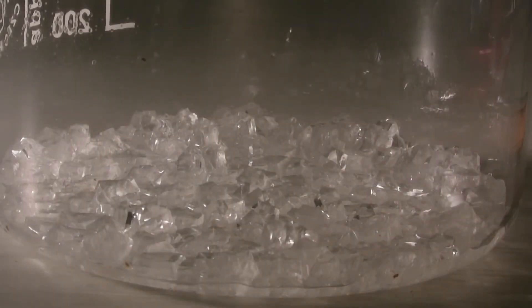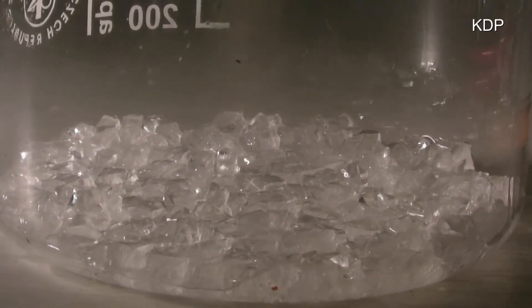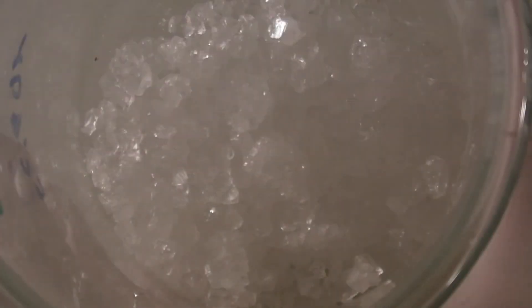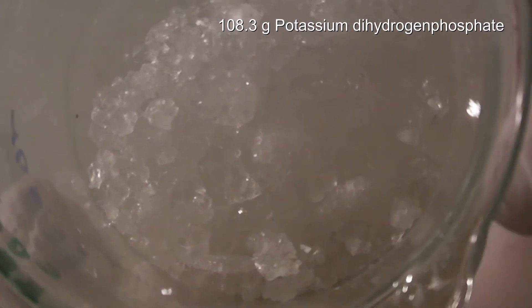Growing large crystals is easy, so it is also used under the abbreviation of KDP. After drying it, 108.3 grams of potassium dihydrogen phosphate were obtained, which would correspond to a yield of 54%.